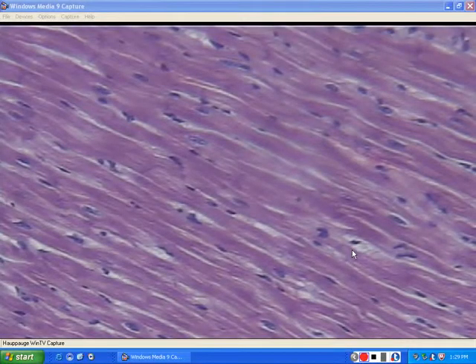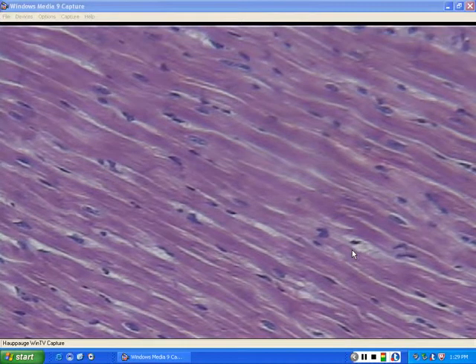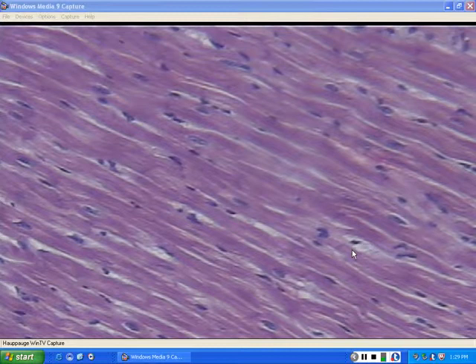And we'll move on to take a look at our next one, which will be cardiac muscle, in which we can see some distinctive differences. So we move to cardiac muscle, which makes up the entire muscular part of the heart, the non-venous portions. So this one has a very unique location. It's only found in the heart, and has a few very unique characteristics.